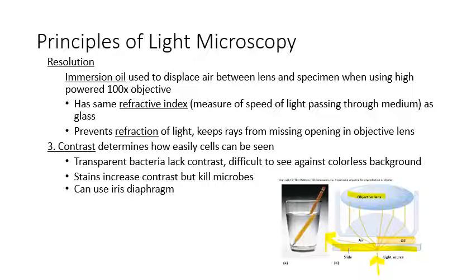One way to prevent that scattering of light is to add some oil. So if we add oil between the lens and the slide itself when we're using our microscope, that can help us bend some of these rays of light. So instead of escaping, they go up towards the lens itself, and that's going to improve our resolution when we're at really, really high magnification. So that's called oil immersion because we immerse the field in oil to stop the scattering of light.